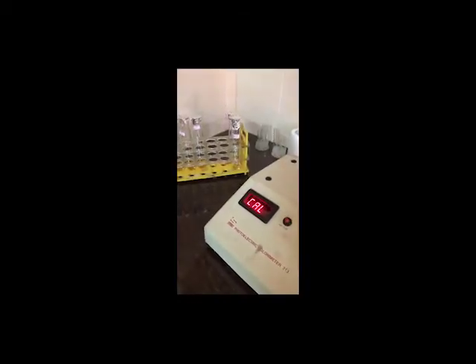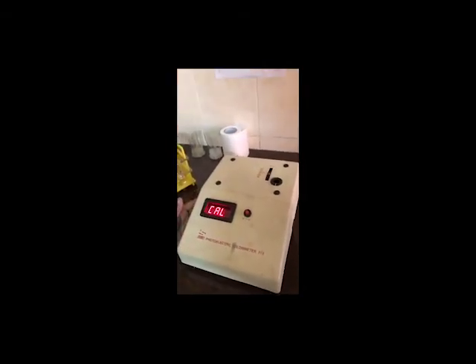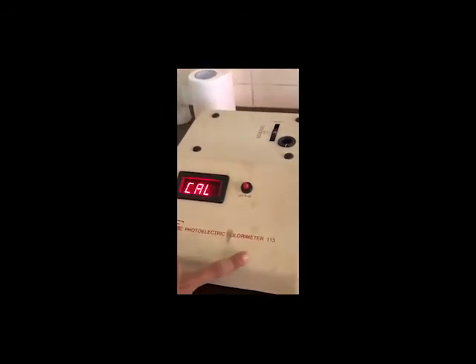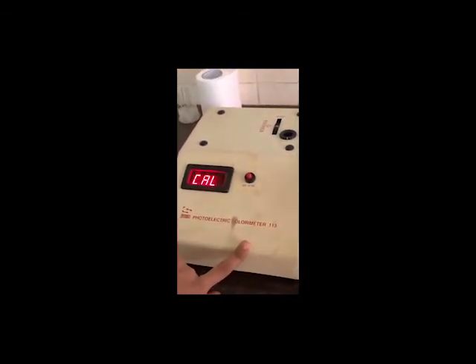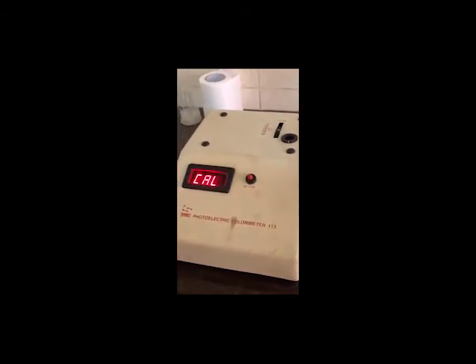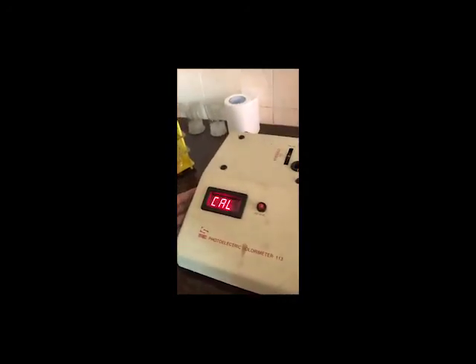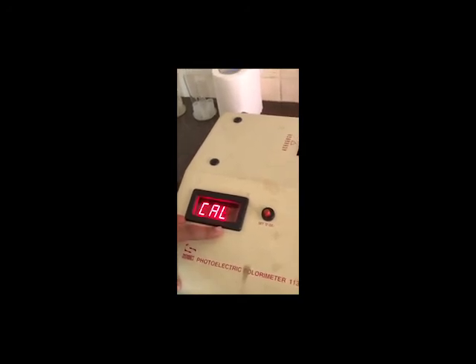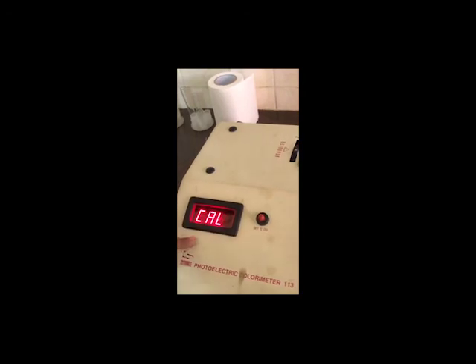Now we can look at the working of a colorimeter. This is a colorimeter present in our department. Here we use a Systronics photoelectric colorimeter. It is a 113 type digital photoelectric colorimeter with 8 filters. There are similar products from different companies available. Looking at the surface of this instrument, first you can see a display. This is a 3-digit digital display. Calibrated optical density measurements are seen here.